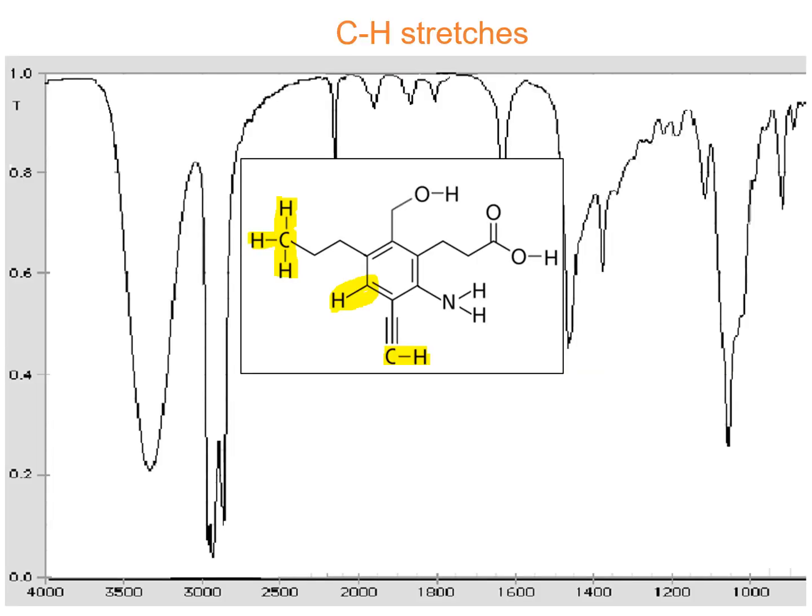So starting with the simplest one, and 100% they will be present in every IR spectrum. It is because they are originating from carbon and hydrogen, because organic molecules are necessarily hydrocarbons.